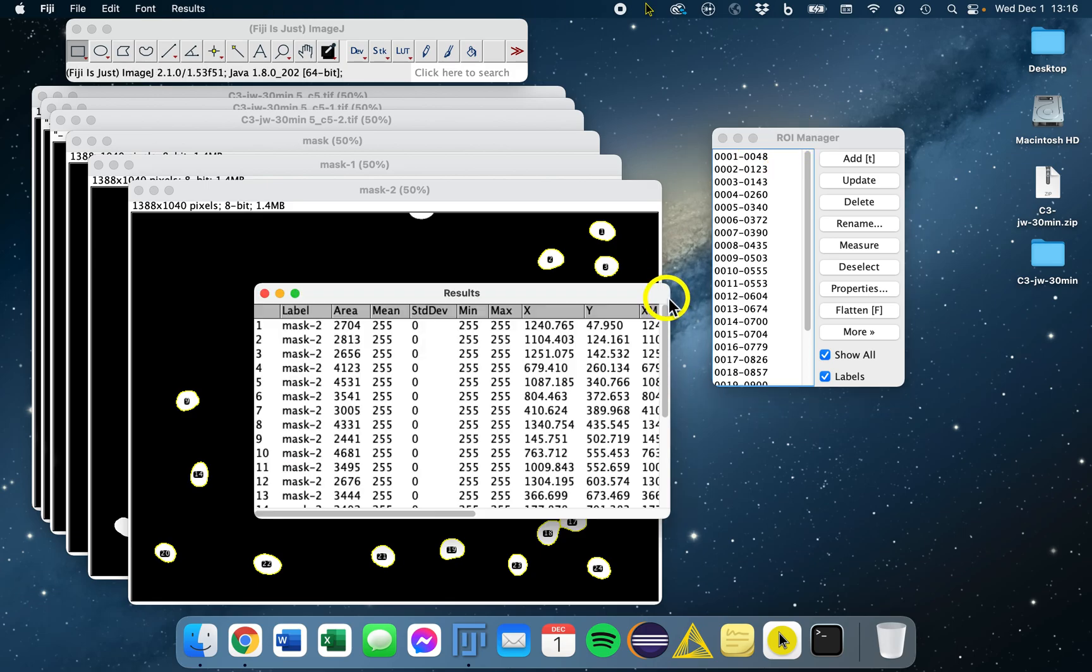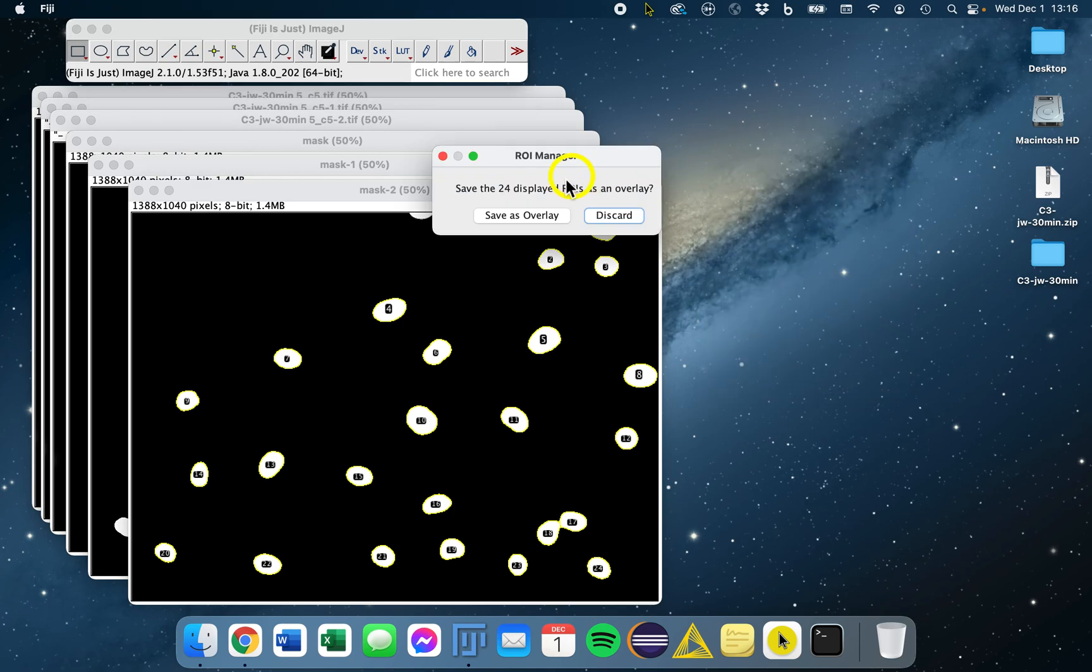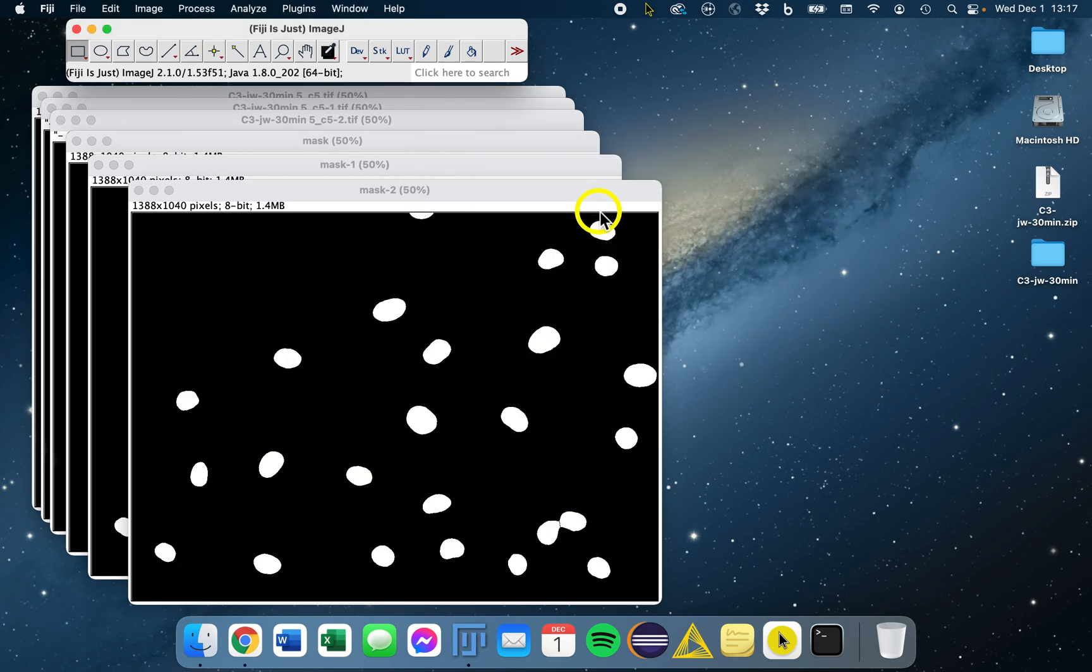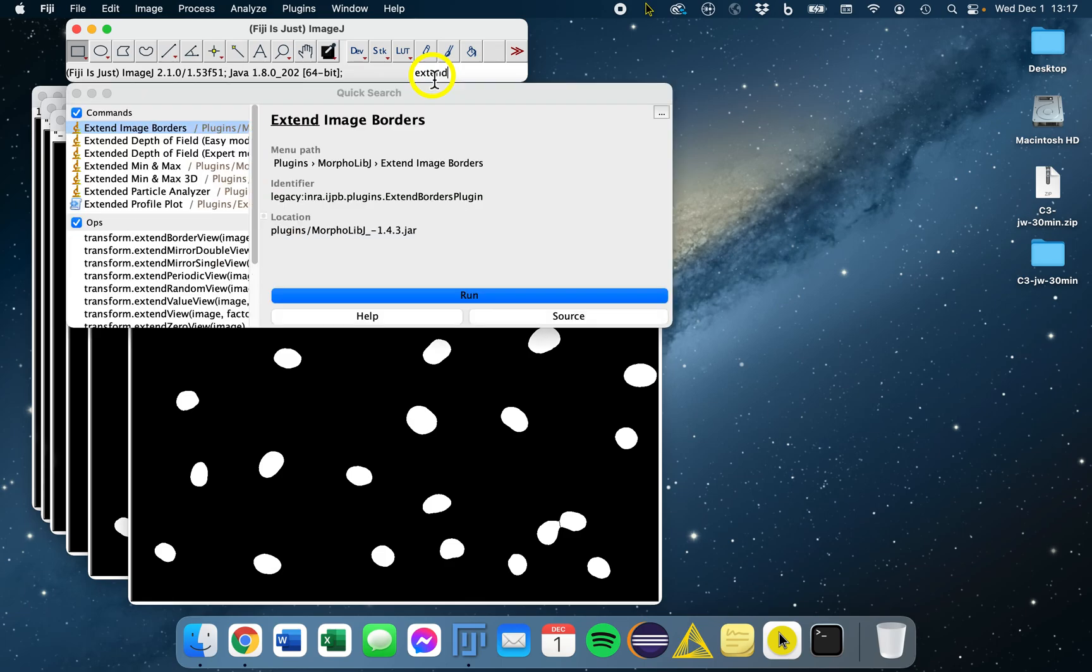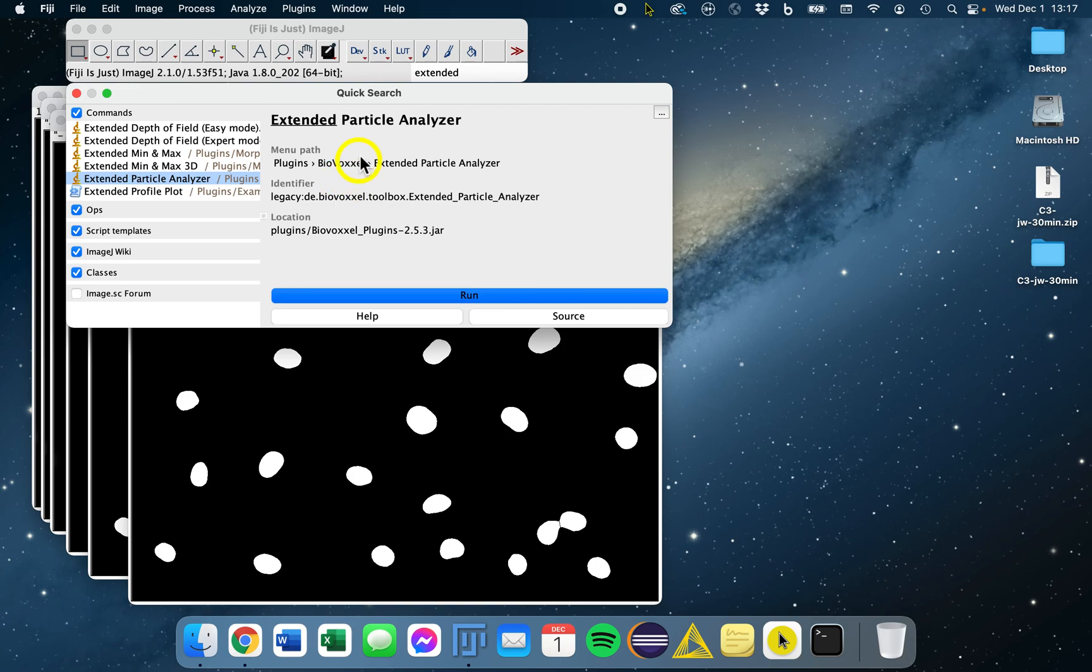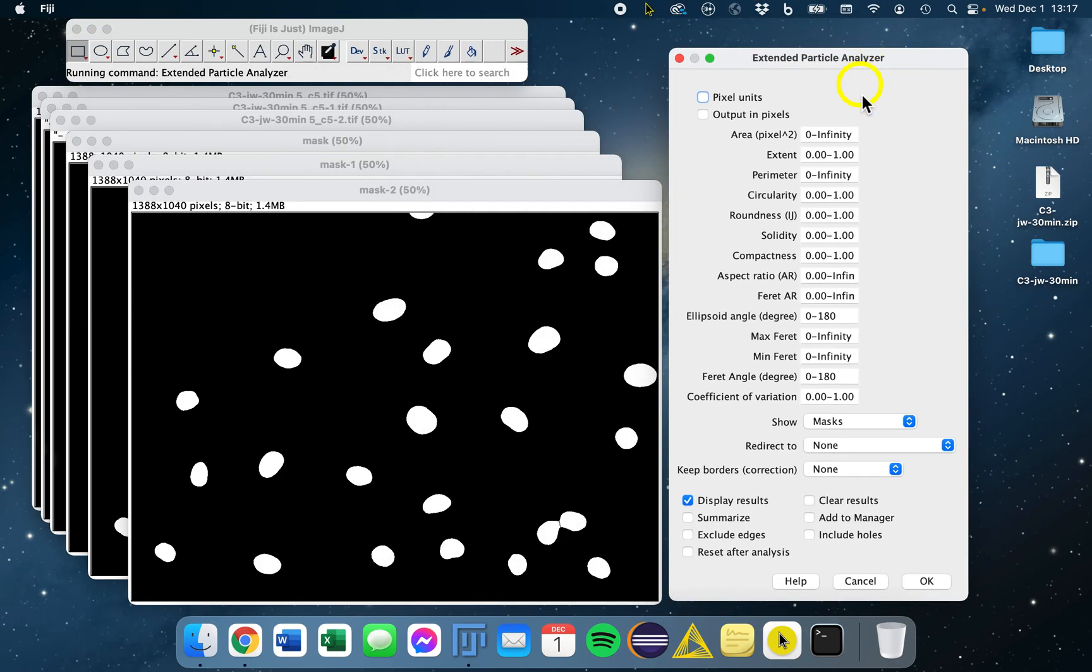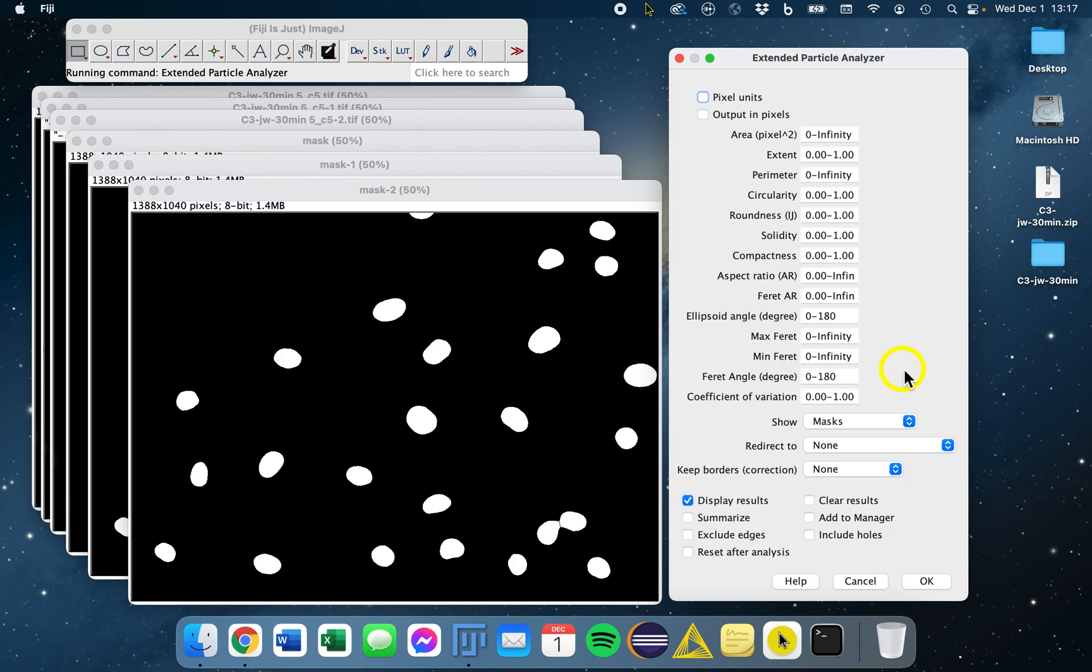But I did just want to tell you one more thing. There is another option for Analyze Particles. It's part of the BioVoxel Toolkit called Extended Particle Analyzer. You can enable this update site for BioVoxel and get access to this tool. Then you have a whole host of even more features that you can filter on, not just size, but perimeter, circularity, roundness, solidity, and so on. So this is also a great tool. You can enable the BioVoxel update site and get access to this Extended Particle Analyzer.